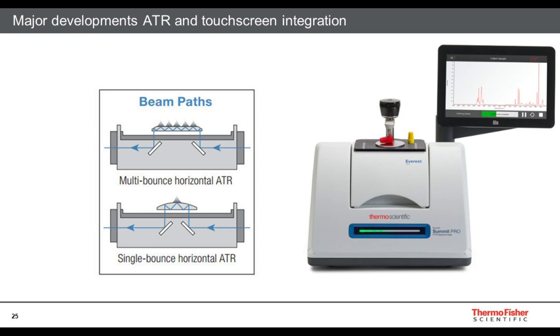However, the physics shows that at that point of total internal reflectance, you will form an evanescent wave. That evanescent wave is shown by these small, decreasingly gray triangles that extend up. Those are evanescent waves that extend out beyond the point of total internal reflectance, but don't detract from it in and of themselves. They do, however, have the ability to interact with a neighboring substance and couple light into that for absorption purposes.